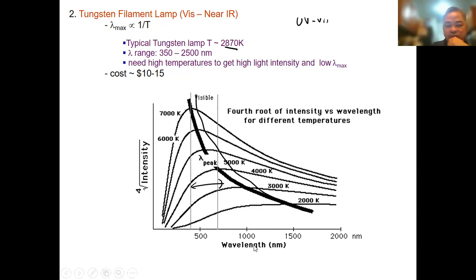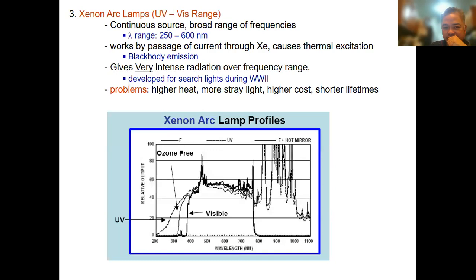So these are the ones commonly used, the old model. But now, most of them use this one. But this is famously used not in UV-Vis; maybe when we go to fluorescence, that's where they use this thing. If you go to the recording that I have for 137.1, I think the way I presented it there is all the light sources of the different spectroscopic methods. So we go through them one by one. That's why this is, we could say, from a different perspective.